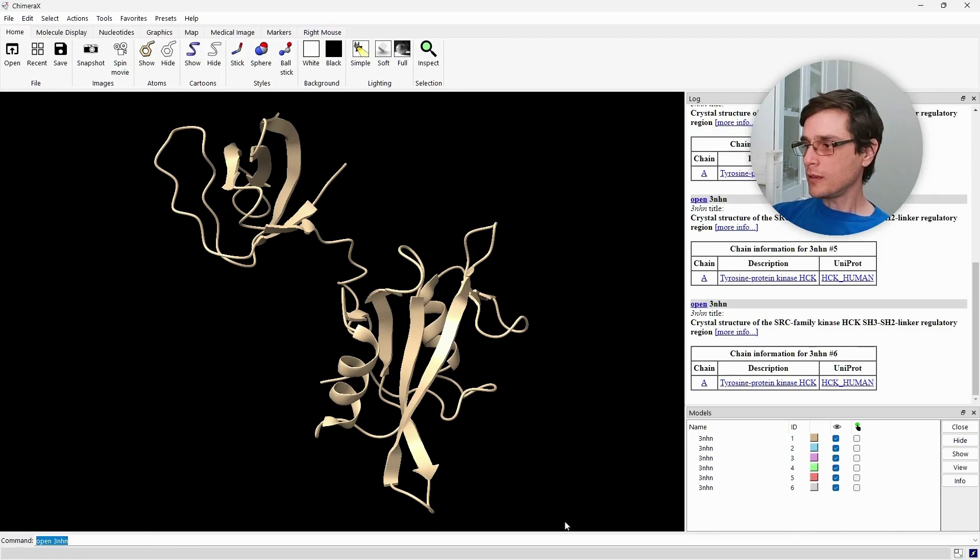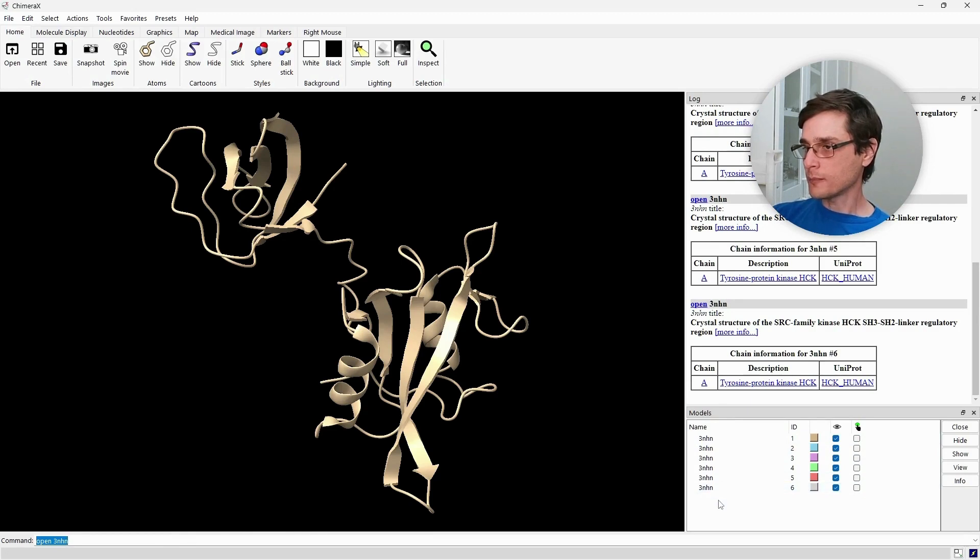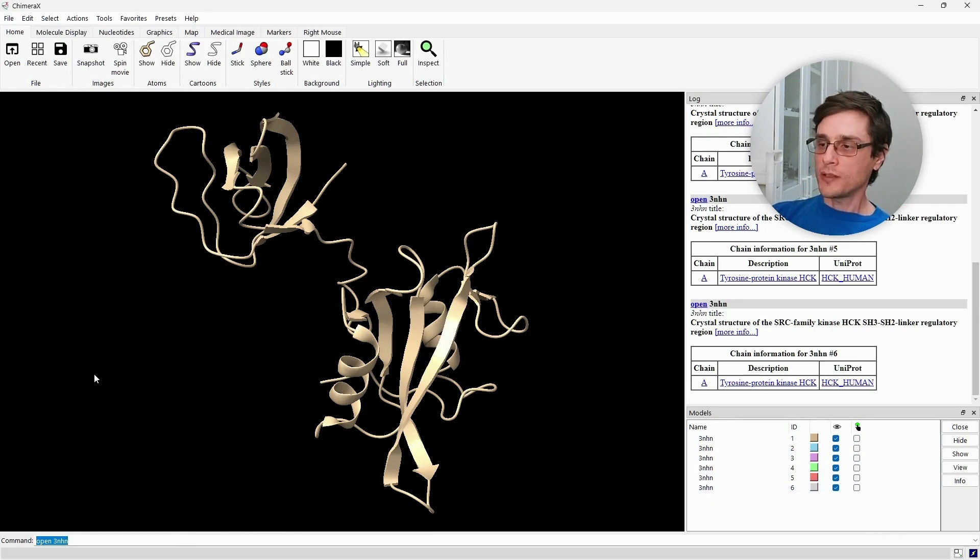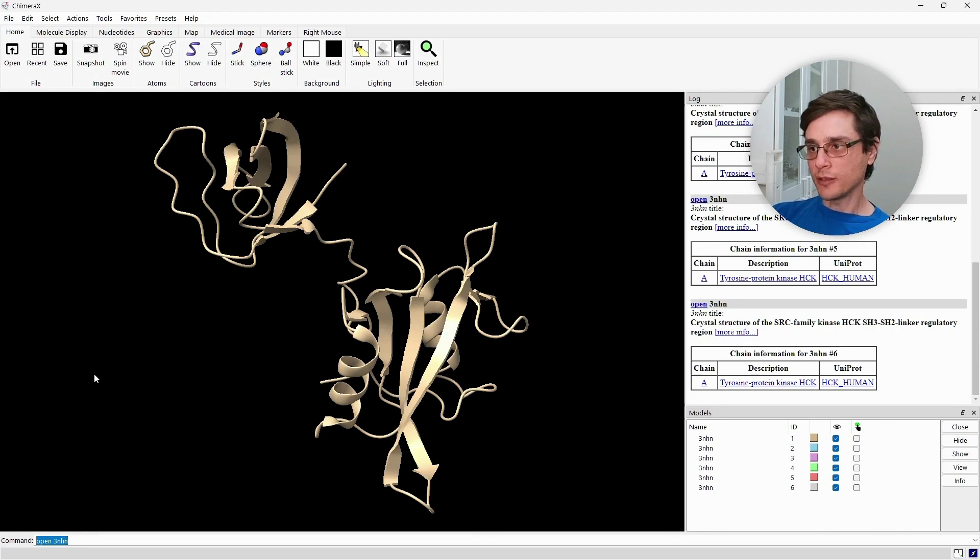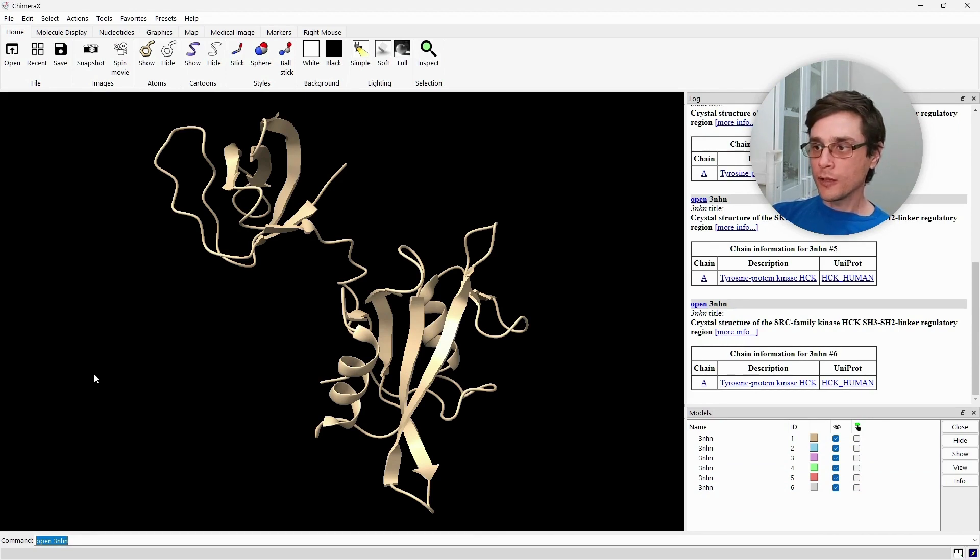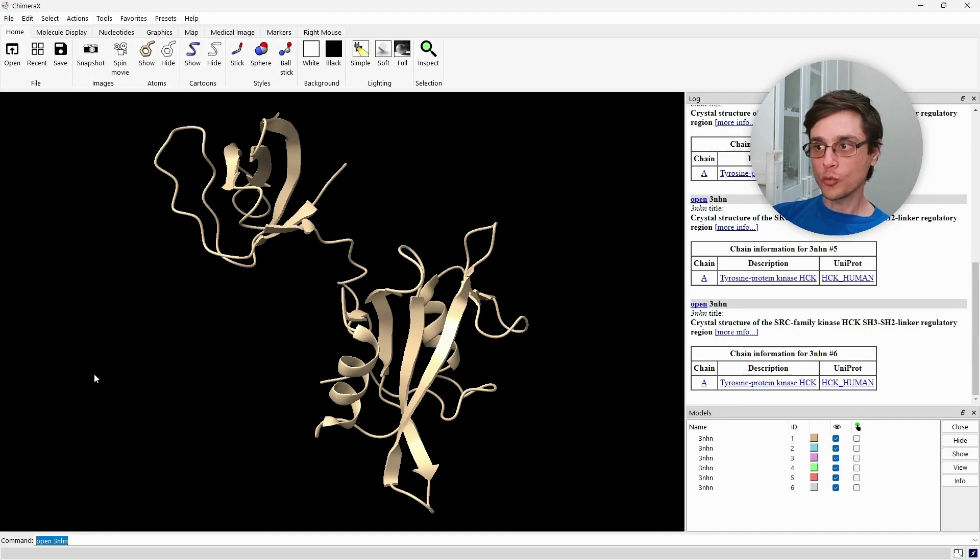We can see in the models panel that the model has been loaded six times. But we can see that all the structures overlap each other. We need to position them differently. First, let's zoom out. We can do that using the mouse wheel.